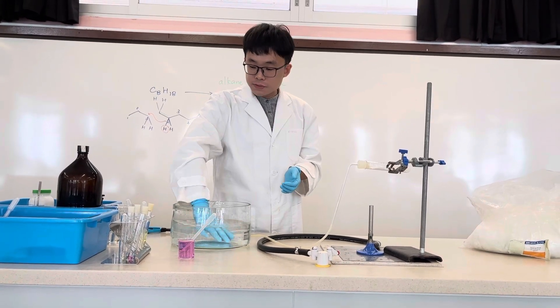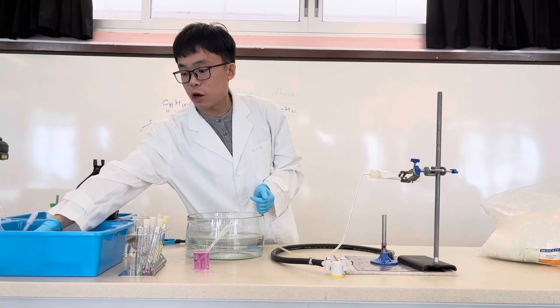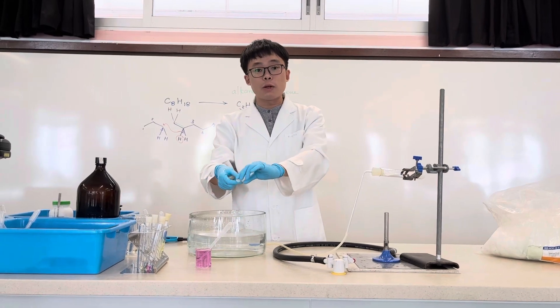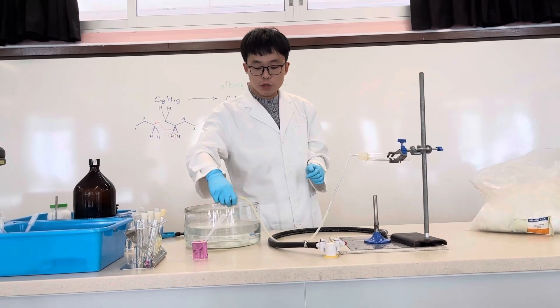We expel all the air out of the test tube, which we will immerse into this tank of water. For convenience, we are going to put a stopper in it as well, so that when the gaseous product has been collected we can stopper it underneath the water and put the tube link in.